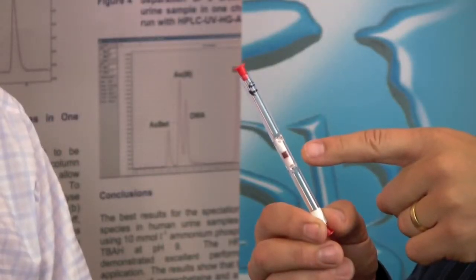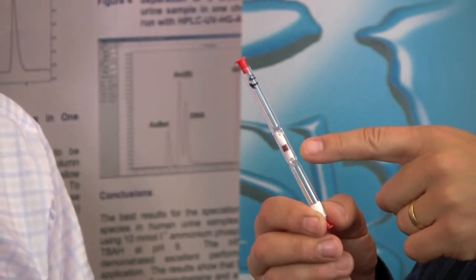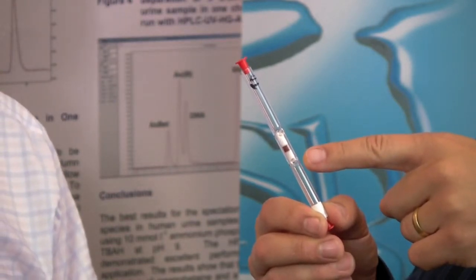So what we use is a gold trap, which I've got one here, which is essentially gold impregnated onto silica, so it has a very high surface area. And when you pass a gas sample across this tube, the mercury compounds collect on the gold surface by an amalgamation process. And this type of trap will collect all forms of mercury, so it's considered as a total gaseous mercury measurement.